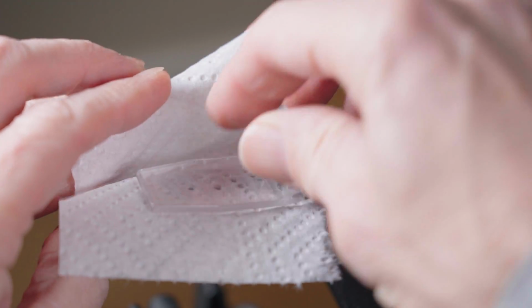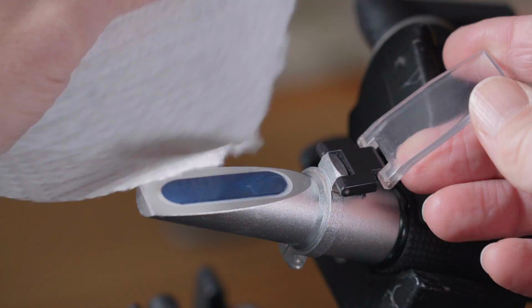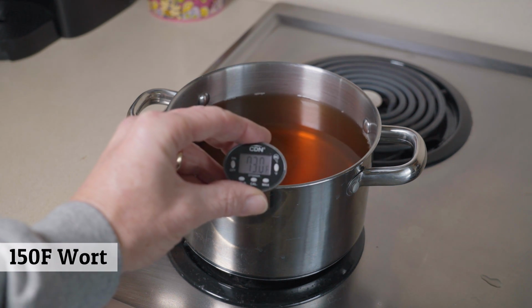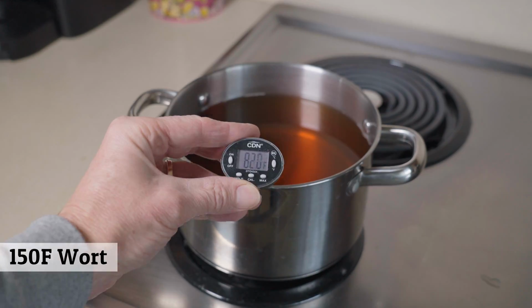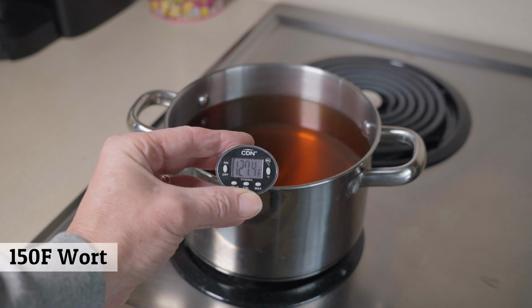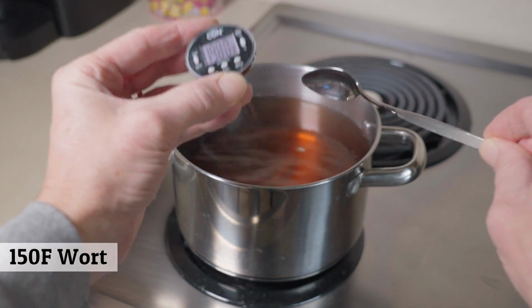And I'm just going to show that I clean it off each time between all the readings, wipe all the old wort off and dry it off so we have a neutral starting point. All right, next we're going to jump up to 150 degrees Fahrenheit. And I'm going to speed the video up here just so we don't bore you to death. Here we are at around 150 degrees Fahrenheit.